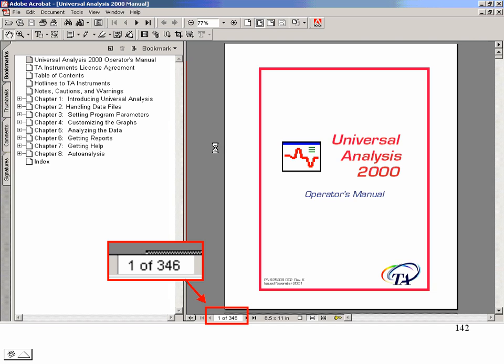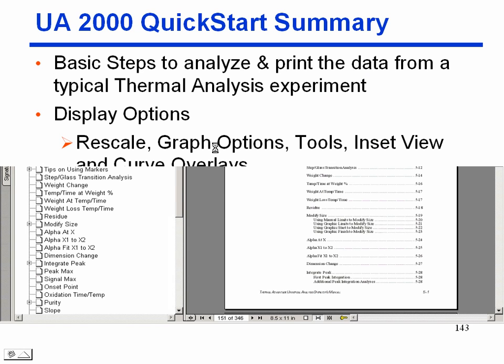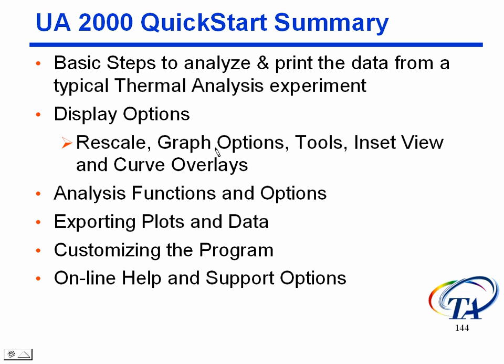You can print the thing out if you want. It's really got a lot of good stuff in it. A whole big chapter on analyzing data. So if you want some reading to do, you can print out the chapter on analyzing data and go to town. So that's basically it.